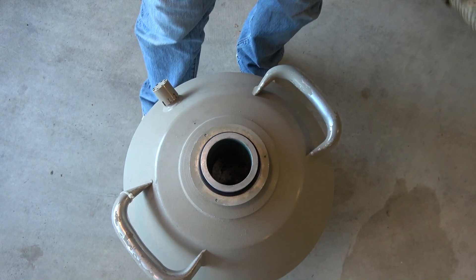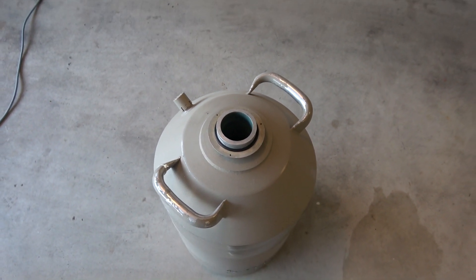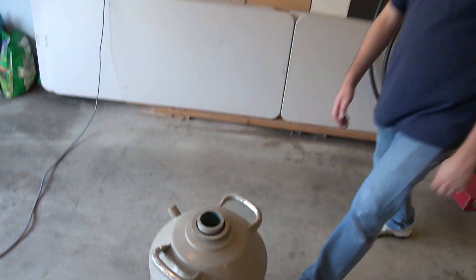So this dewar leaks. When people say their dewar leaks, it's not that nitrogen is coming out — it doesn't hold the cold. That's because it's a vacuum bottle, just like those thermoses you can get and put coffee in, and they'll stay hot for like four days. This works the same way, except it's supposed to hold liquid nitrogen for like two months. So this is a pretty expensive piece of equipment here.